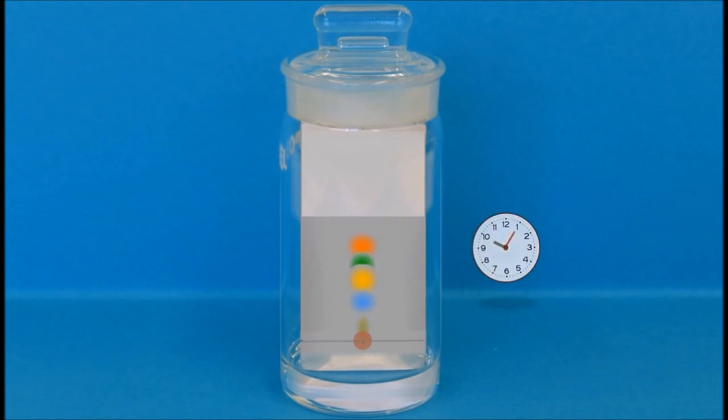As we can see the mixture components are separated on several spots due to different travel distances on the stationary phase.